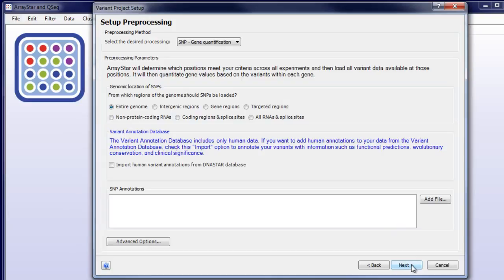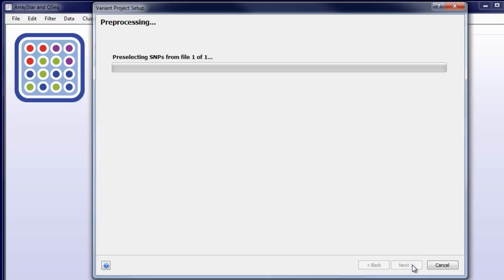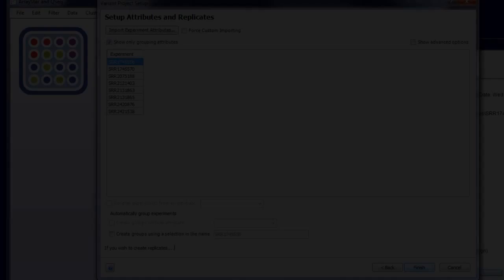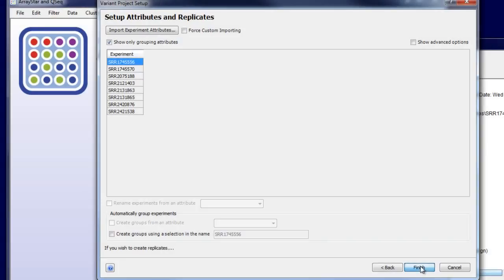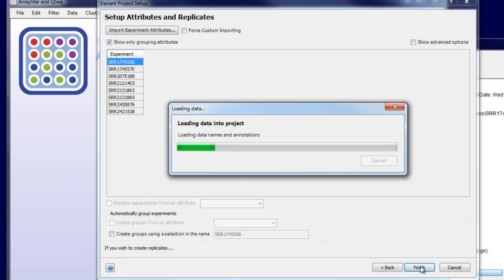Then, click Next, and then Finish to import the SNP data.